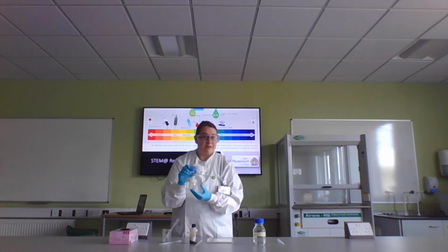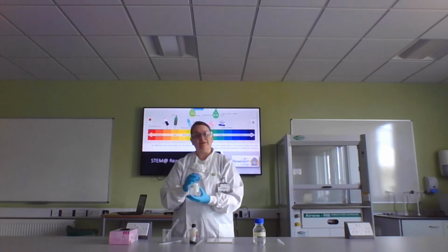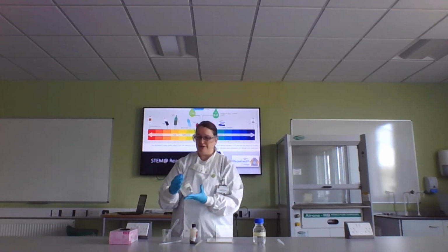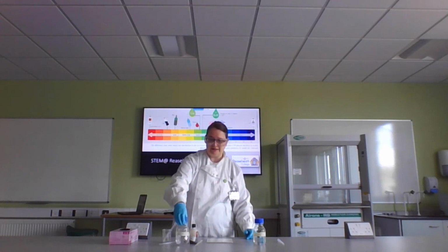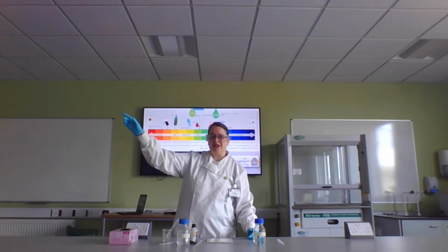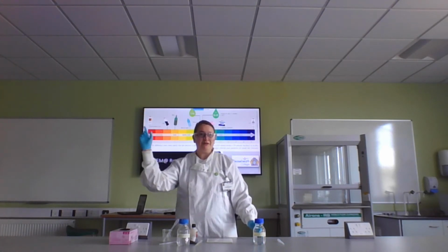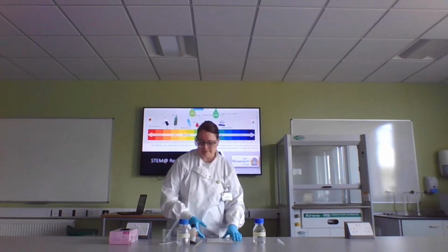If I got this on my skin, it wouldn't burn my skin, it would go straight through my skin, turn my fat layer to soap, would you believe, and then dissolve my bones. Also very bad to get on your skin. While I'm doing this, I happen to know that we have an emergency shower just down the corridor, so if anything goes wrong, I might suddenly run out. Hopefully that's not going to happen.